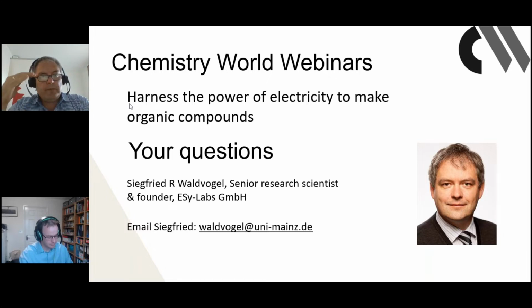Keep in mind, if the solubility of your product drops, then by the Nernst equation it becomes much more stable. Therefore, there will not be much overreaction or anything else. The problem could be that on the electrode, some crystals are growing and then it covers the electrode. There's one thing to do: either mechanically remove them, or if you have the same electrodes as cathode and anode, then after 10 minutes you reverse the electrodes. And this is more often something which works.